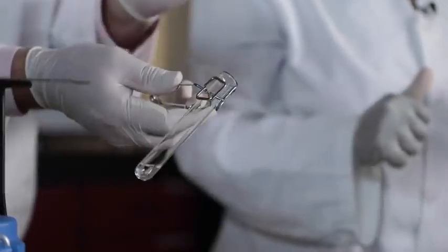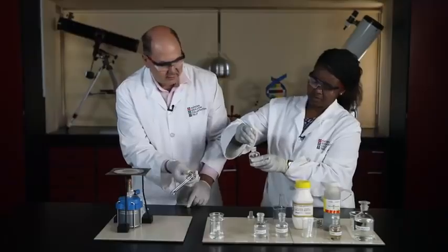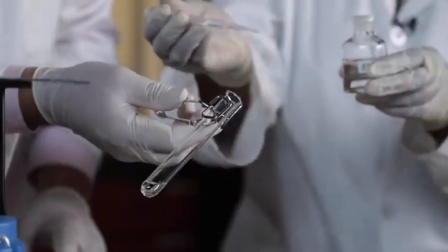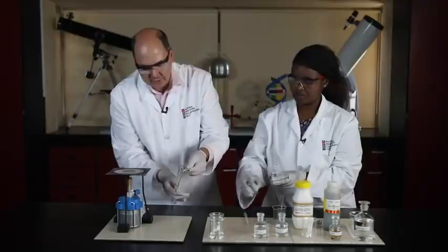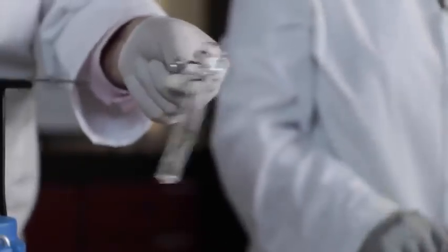Next, we're going to take 20 drops of ethanol. It's about 2 ml of the ethanol into the test tube, and away we go. Let's swirl it around. There we've got our carboxylic acid and alcohol.